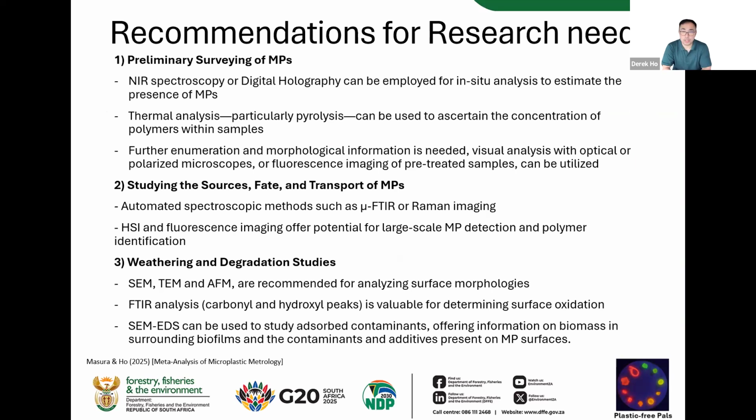So here are some recommendations for your research needs. If you were to be trying to do some preliminary survey of microplastics, we found that near-infrared spectroscopy or digital holography can be employed for in situ analysis to estimate whether microplastics are present. If you want to ascertain the concentration of polymers, you can use thermal analysis, particularly pyrolysis.